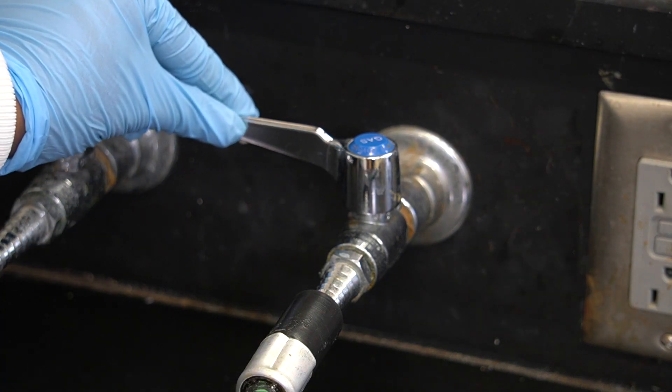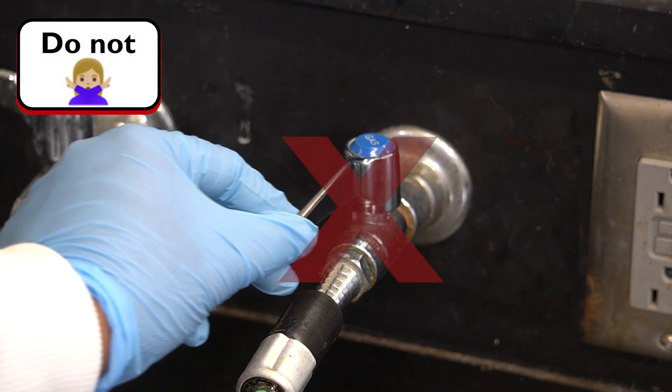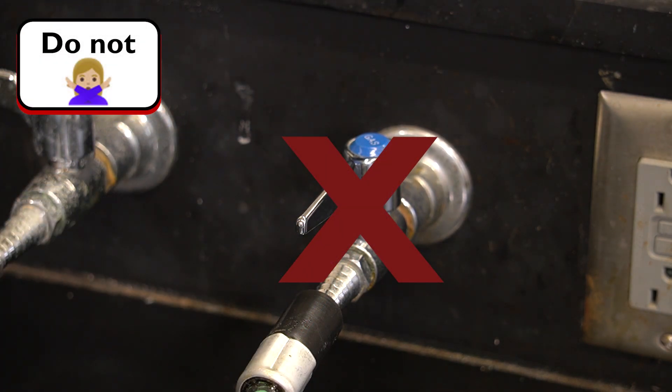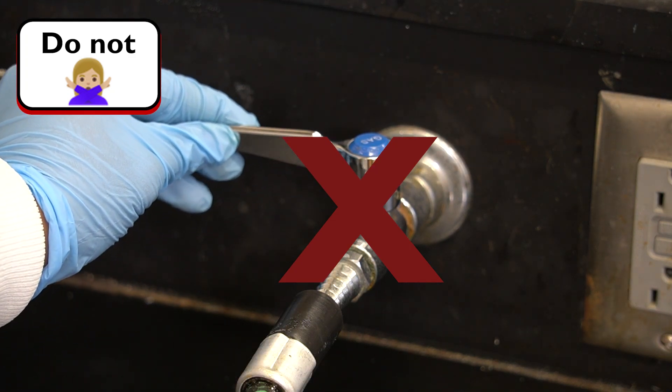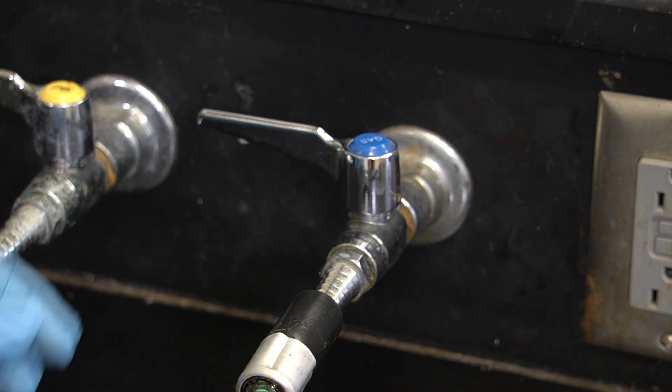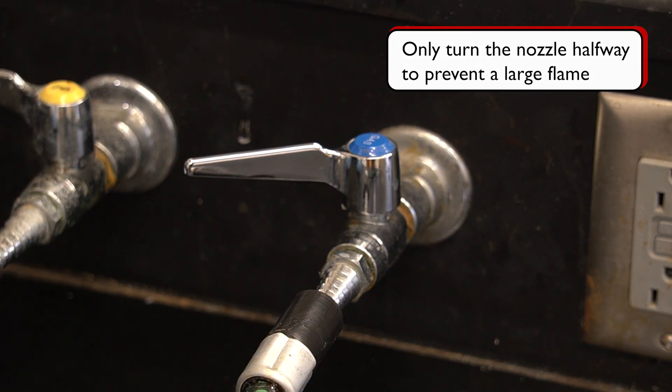Turn on the gas nozzle to allow natural gas into the burner. Do not turn it all the way on to the parallel position at once. This is to prevent producing a large flame upon striking, which might cause a fire hazard. Instead, we can turn the handle halfway at first and adjust the setting later once the flame is lit.